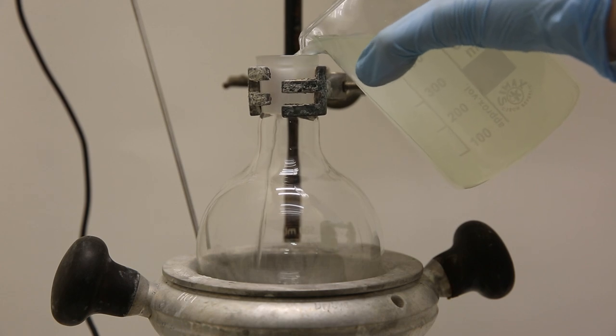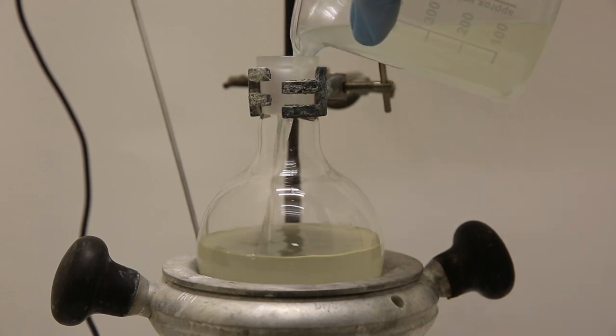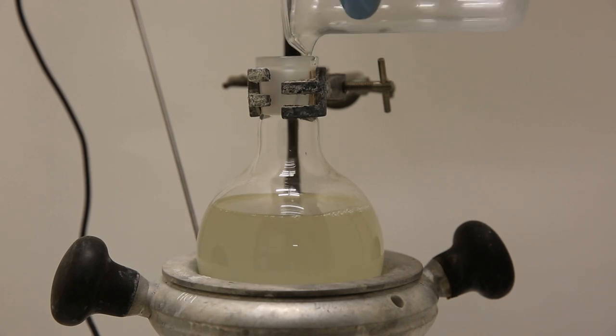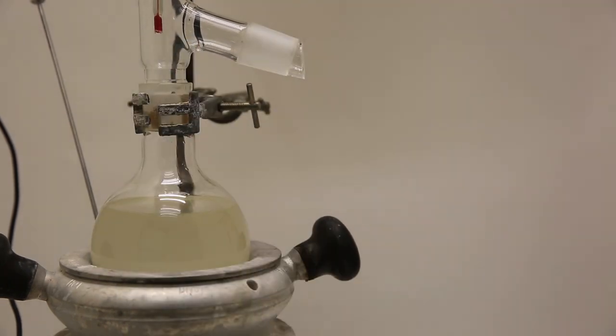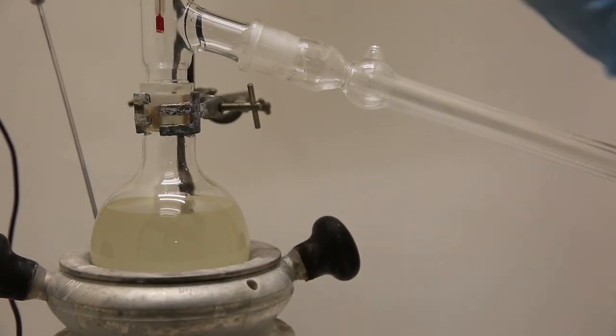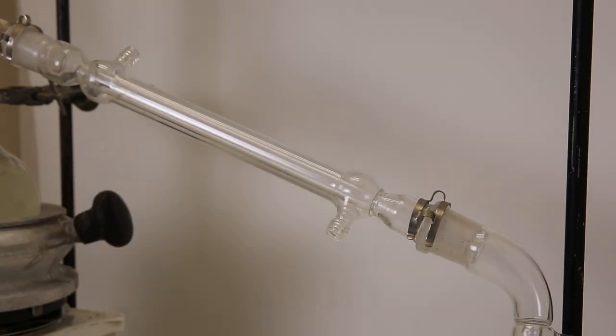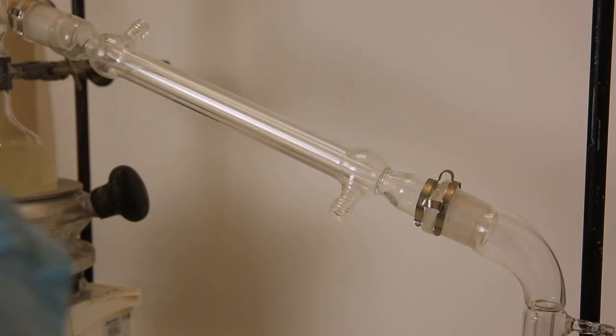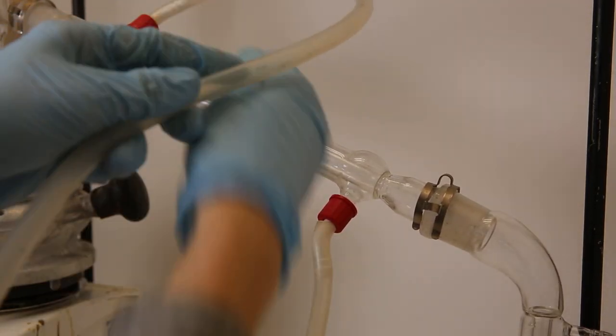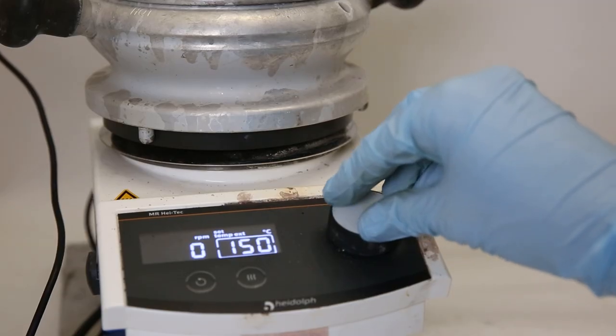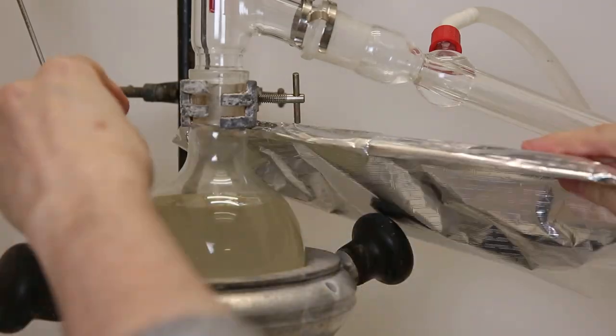So after I have washed all of my biodiesel, I need to remove the toluene, so I simply set it up for distillation so I can recover some of my toluene. I set a high temperature to make sure the toluene will boil, and then I insulate the flask with some aluminum foil.